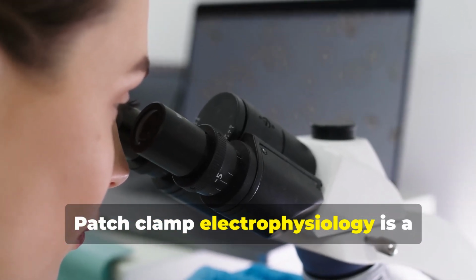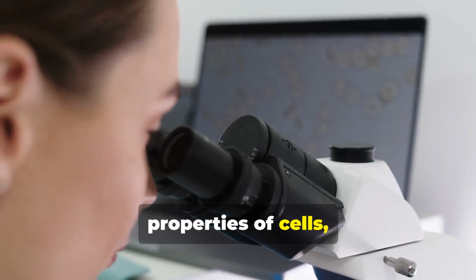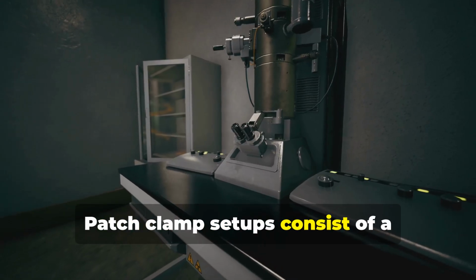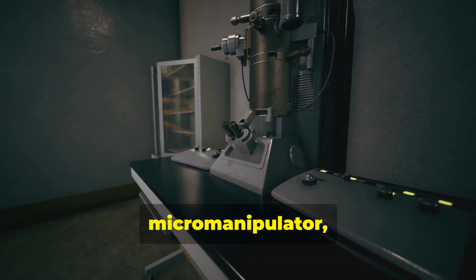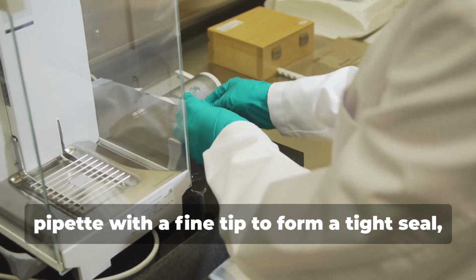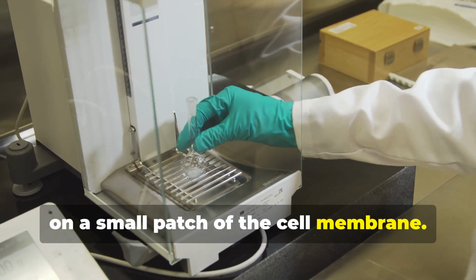Patch clamp electrophysiology is a technique used to study the electrical properties of cells, particularly ion channels in the cell membrane. Patch clamp setups consist of a sophisticated apparatus that includes a microscope, micromanipulator, and amplifier. The technique involves using a glass pipette with a fine tip to form a tight seal, or gigaseal, on a small patch of the cell membrane.